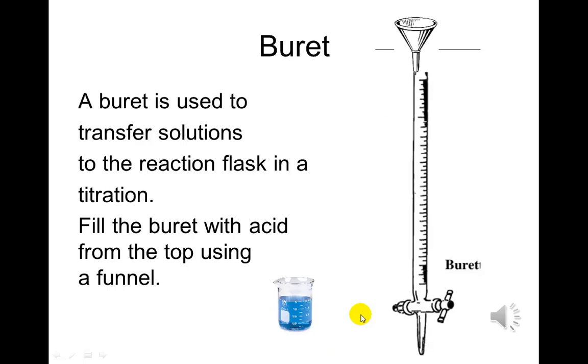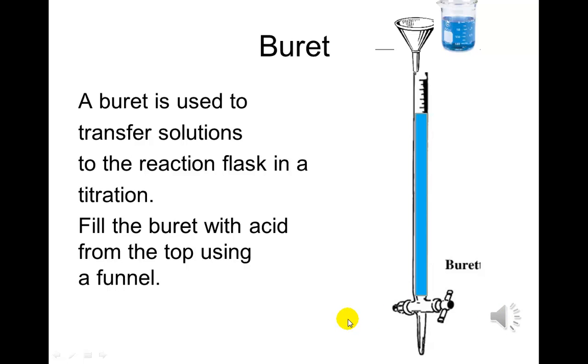And we're going to be using a funnel. We go ahead and transfer it in. There we go. All right, so it's finally full there. Okay, then when it's in there, notice we've got a valve at the bottom. We can open the valve and then we can allow the solution to drip out the bottom. We can open it up at full force so it actually drains out quickly, or we can open that valve only slightly, and then we can get the solution to come out drop by drop.